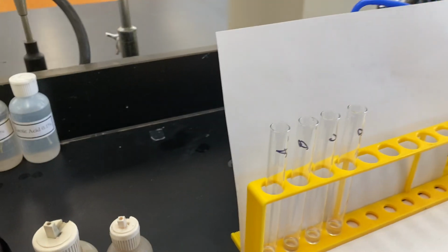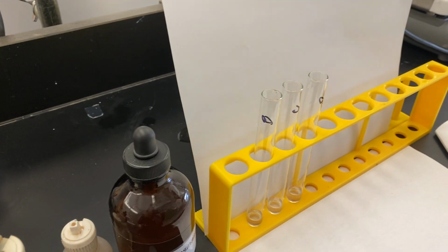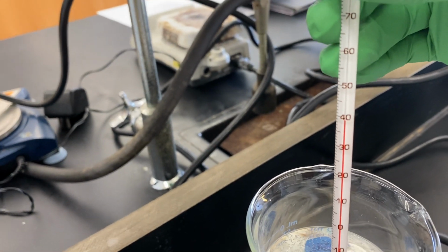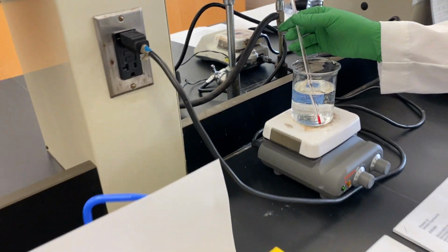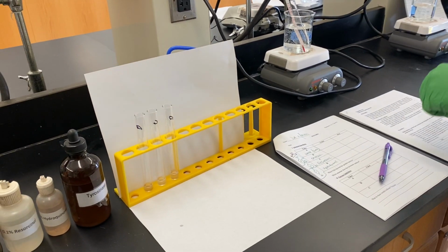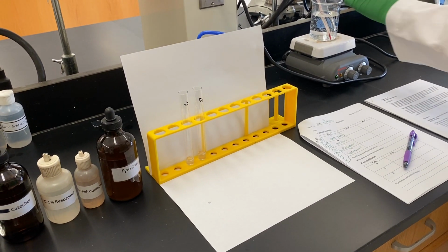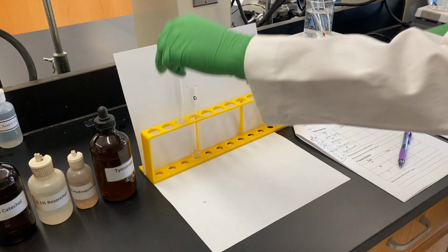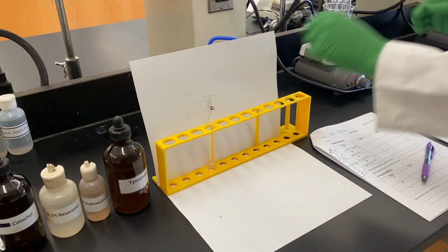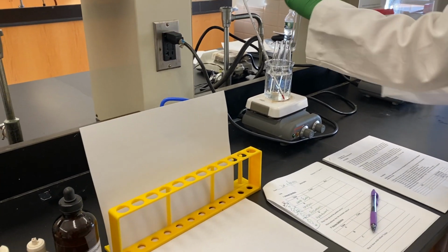we're in D. Okay, so again, test tube A, we're going to put this in a hot water bath. The water bath is set to 40 degrees Celsius. Let's put our test tubes in. Test tube A is the water. Test tube B, catechol, and the tyrosinase, obviously. C is resorcinol. And last into the party, test tube D is hydroquinone.